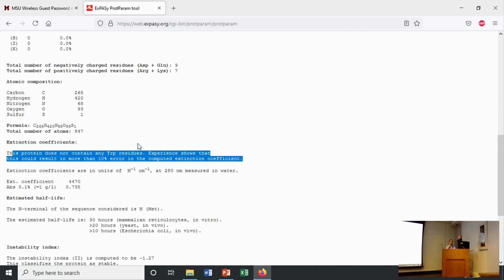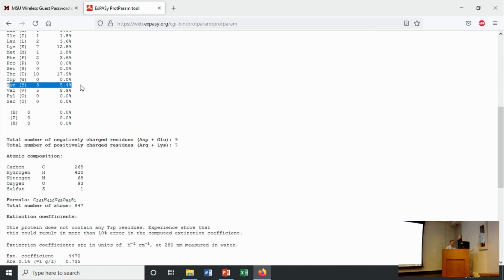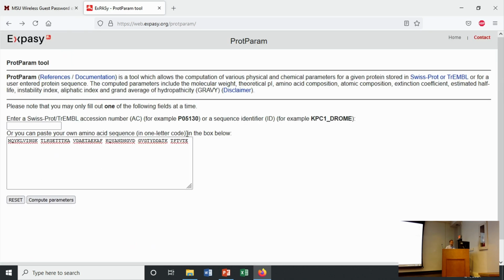And that means that, remember, the primary molecular moiety giving rise to absorption at 280 nanometers is the indole ring from your tryptophan. If that's gone, then you're going to absorb much, much less light. And this is strictly coming from the tyrosine residues, of which there are 3. Now, if I go in and delete the tyrosine residues, which I can do because it's a small protein and I can find them, I'm just going to delete them here, not change them to anything.